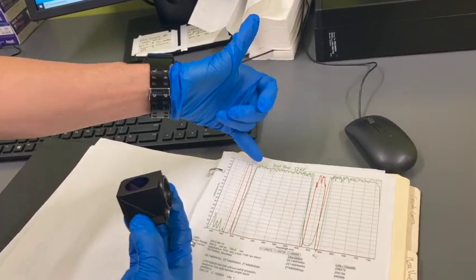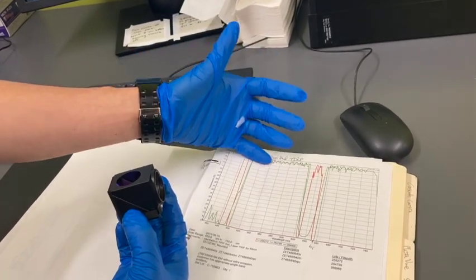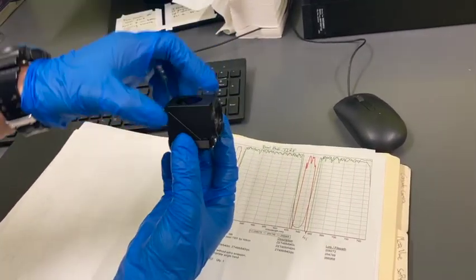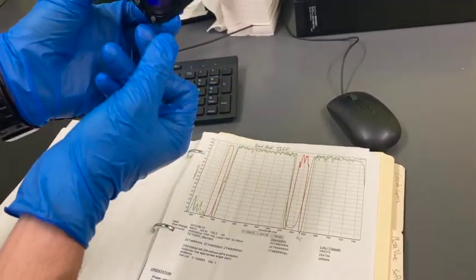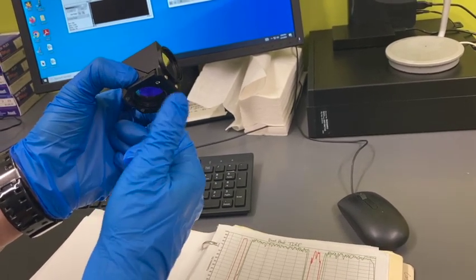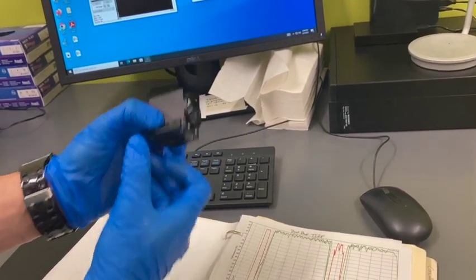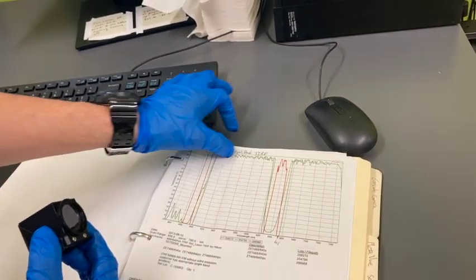And when you see a longer wavelength, the transmission goes very high, to like 99% something. So most of the photons will pass through this filter. And also we have a third filter down here. That's our emission filter, that's the more sharp or steep green here.